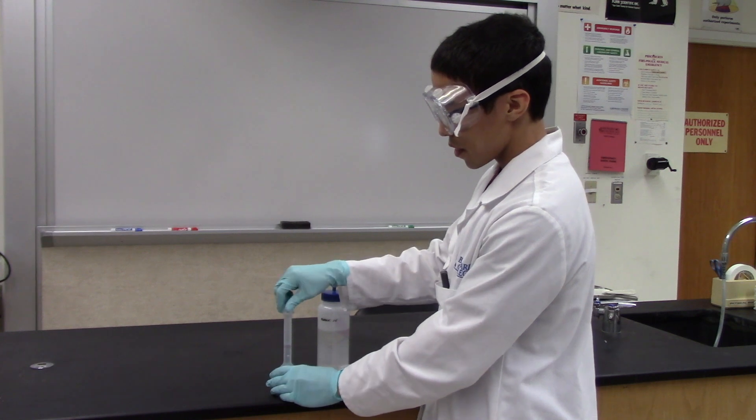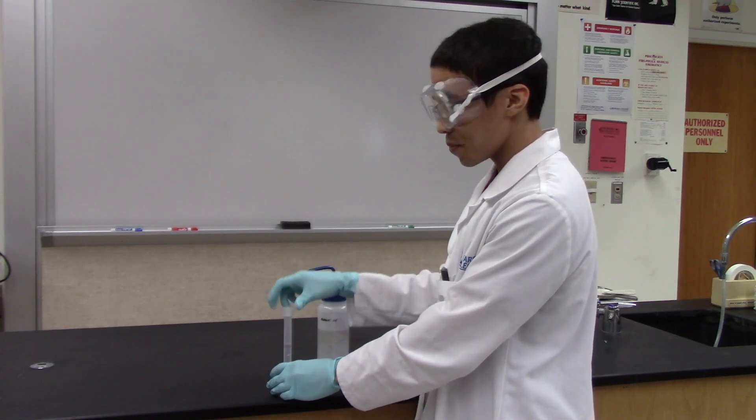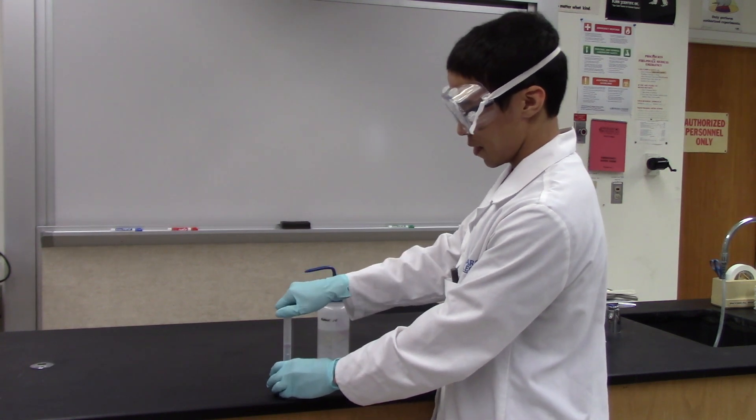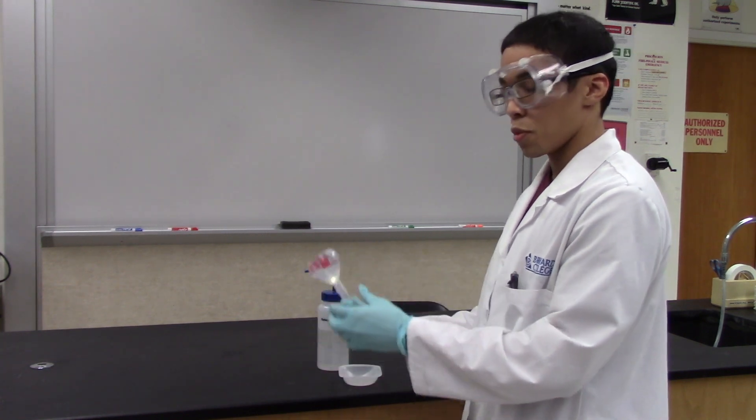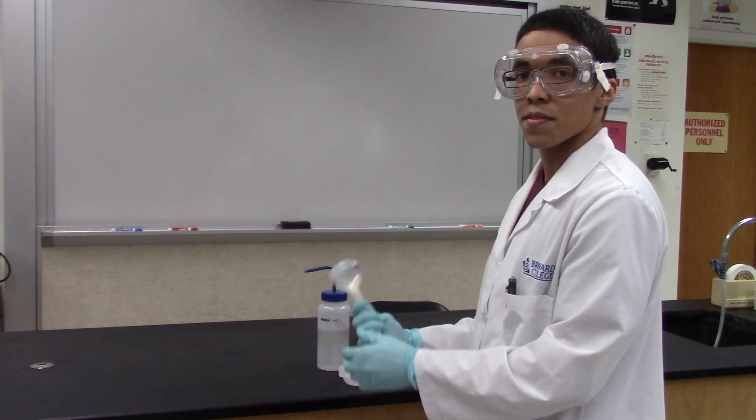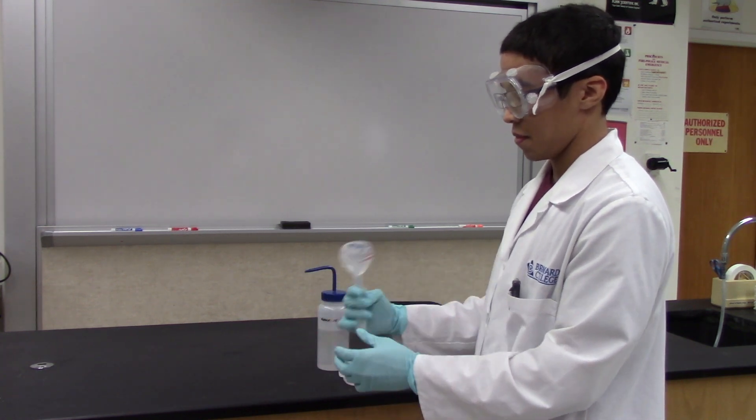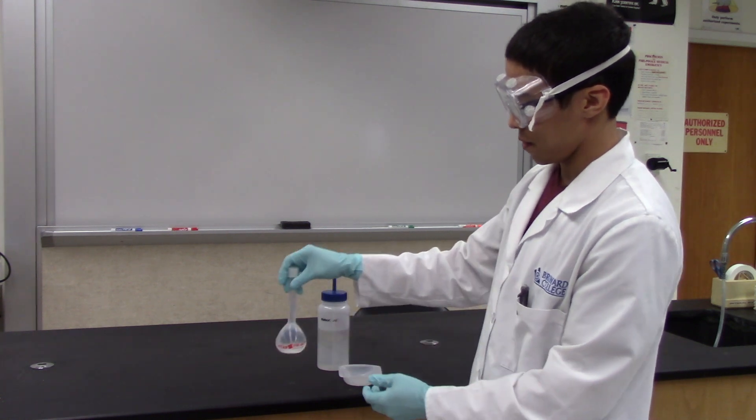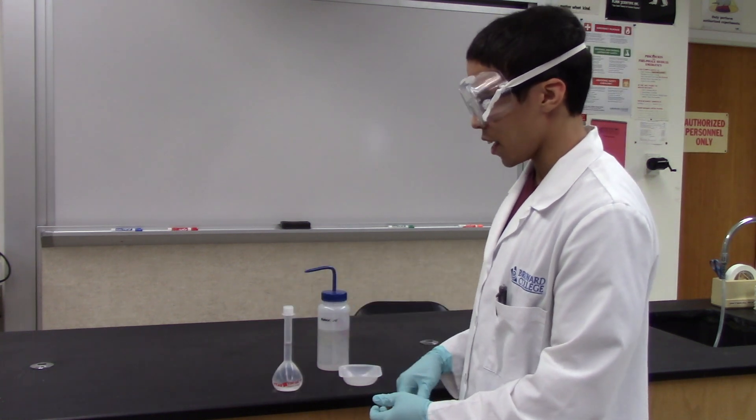Once you have filled the volumetric flask up to the red line, you will cap it and turn it over a couple of times to mix the contents. And that's how you prepare a measured solution.